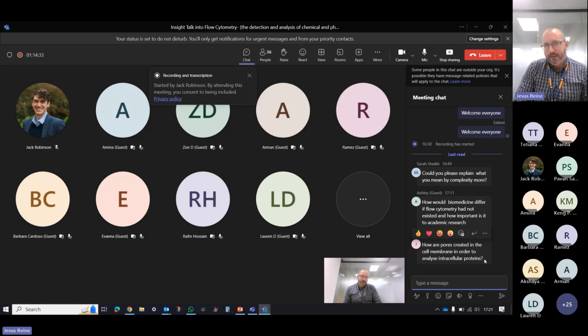There are specific kits where we put a very specific amount of a detergent that doesn't kill the cell, but creates enough pores to allow the antibodies access inside, okay? Depending on the detergent, these pores can be generated on the surface of the cells or also inside the nucleus, because the membrane of the nucleus is also inside. Depending on how much we use, we can choose this.